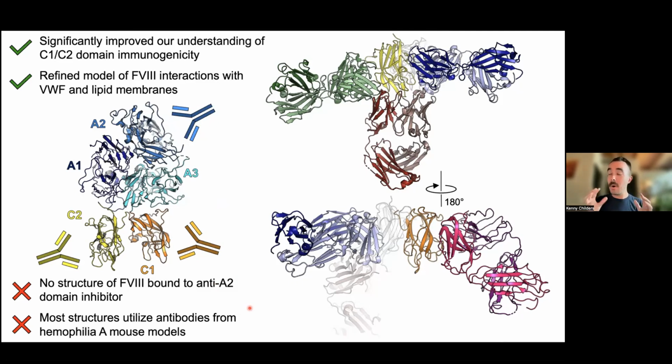But most of these antibodies are not coming from patients, they're coming from mice. And so the talk that I'm going to give today is going to show how we've overcome both of these hurdles using cryo-EM.